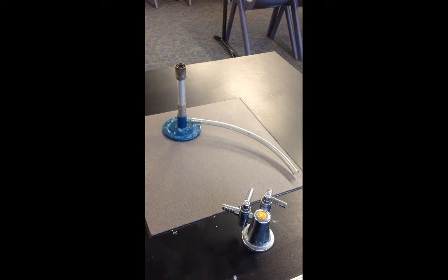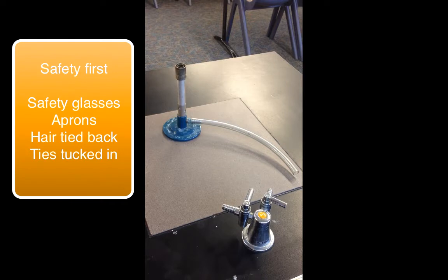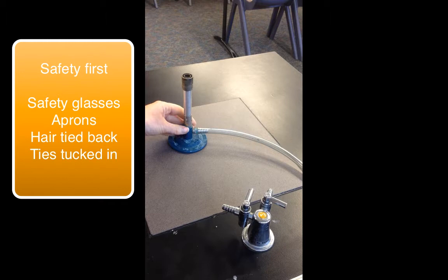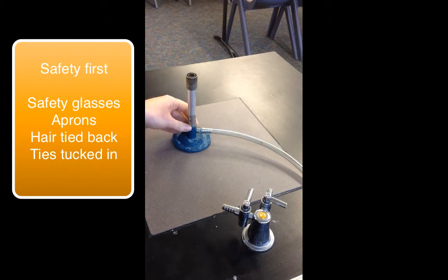Today we will look at how to light a Bunsen burner safely. A Bunsen burner is used to heat things in science laboratories.